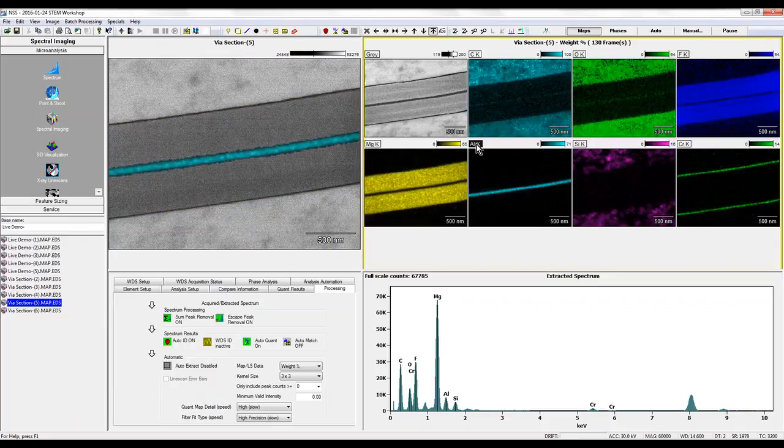In the middle, we have an aluminum layer, and again, that was only 50 nanometers thick, and you can see that the map shows it very, very clearly that that's right where it's located. And the presumption there would be that that's a reflective layer, so it acts as a mirror, essentially, with, again, this magnesium fluoride on the surface to act as the optical medium. And of course, it's mirror imaged in structure, the whole crystal, in order to allow you to see it from both sides, because of course in the polymer matrix they're going to be randomly oriented.